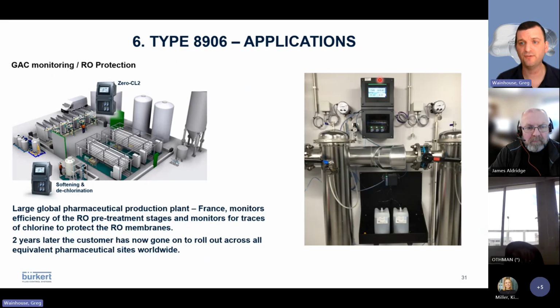Just very briefly to finish, because I do realize that we have run over a little bit here now, but we are coming towards the end of the presentation. This is another global pharmaceutical application detecting chlorine, protecting an RO system.